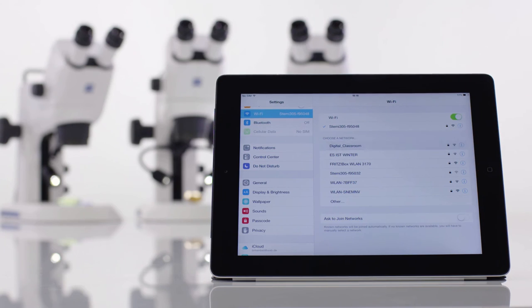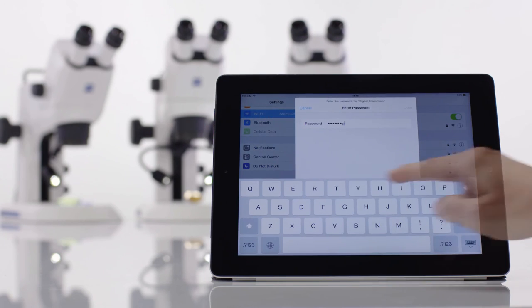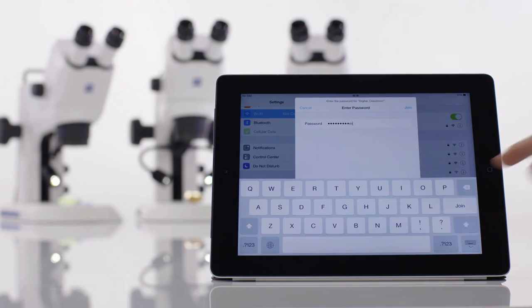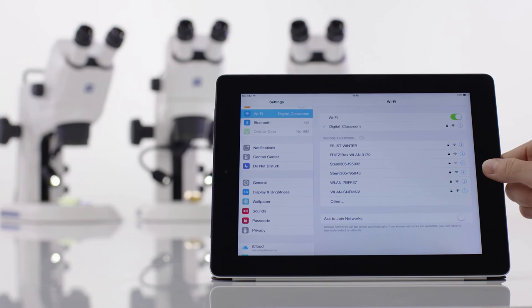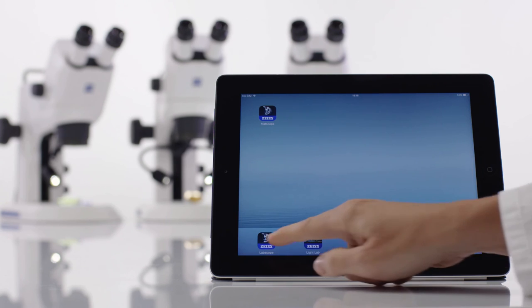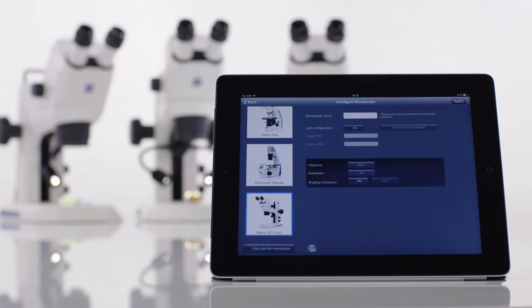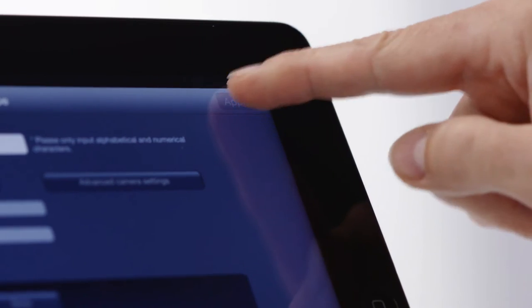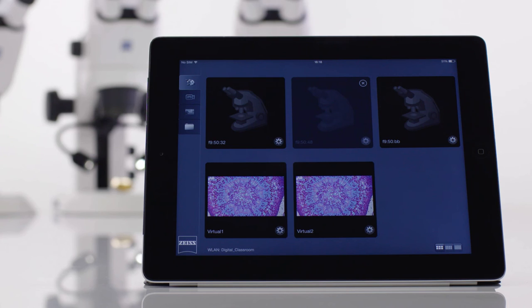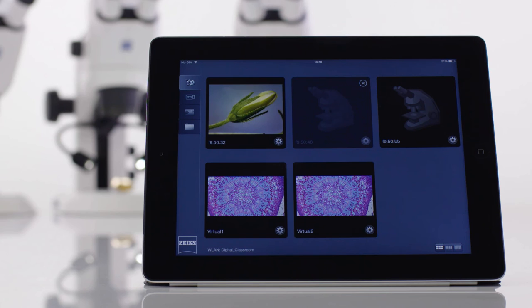Now connect the iPad to your Wi-Fi and start LabScope again. The microscope thumbnail will appear instantly.